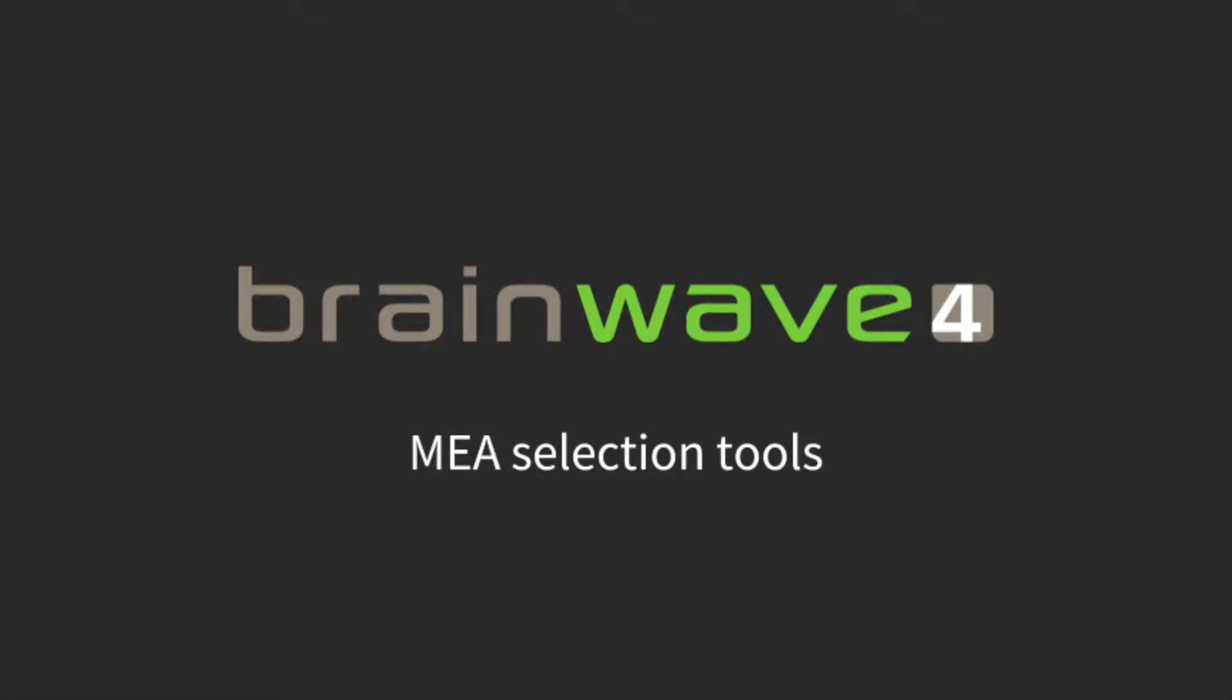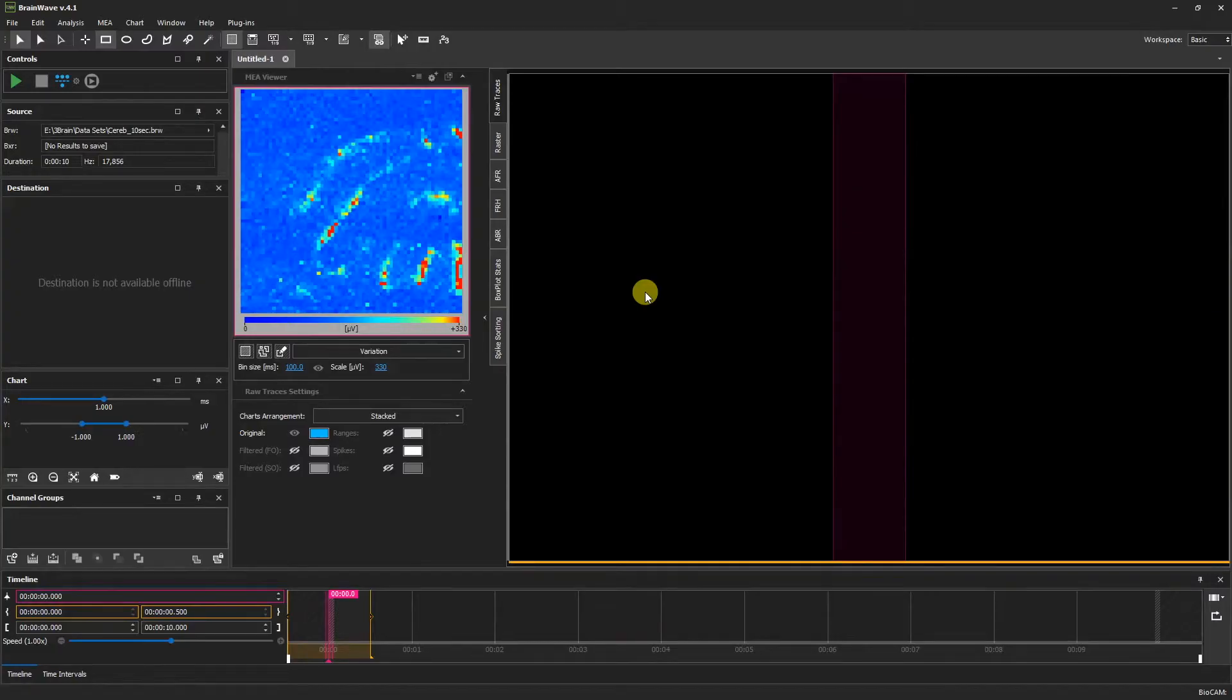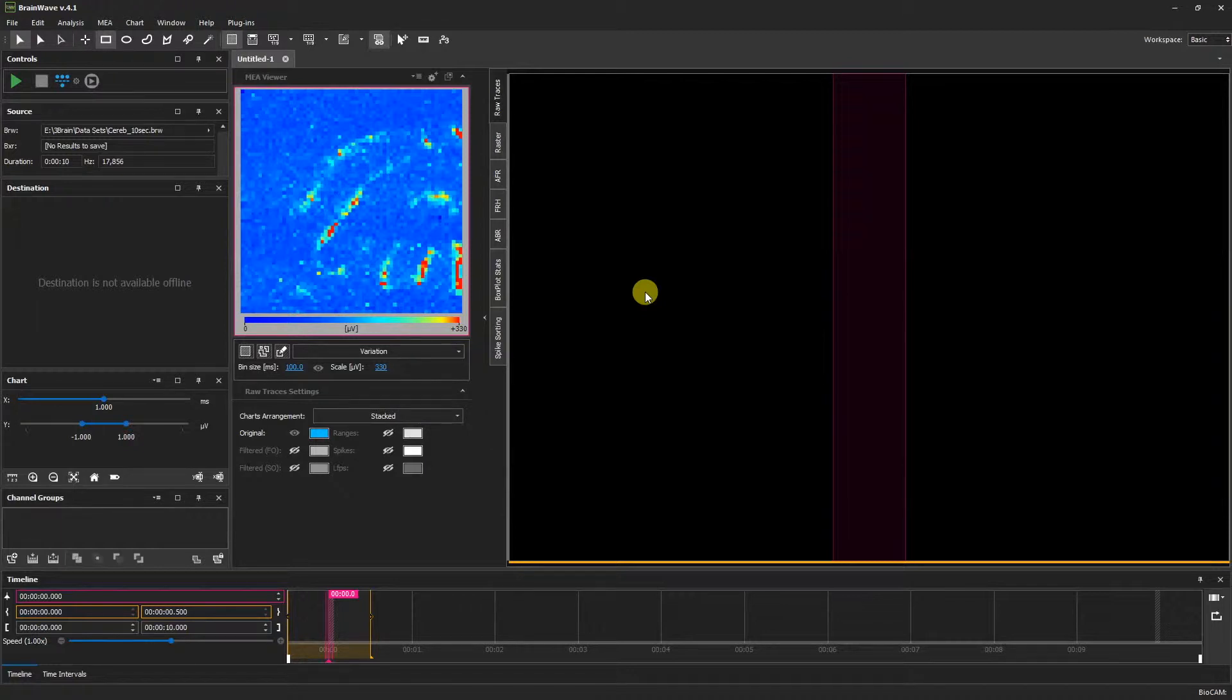MEA Selection Tools. This video is a continuation of the previous videos MEA Viewer 1 and MEA Viewer 2.